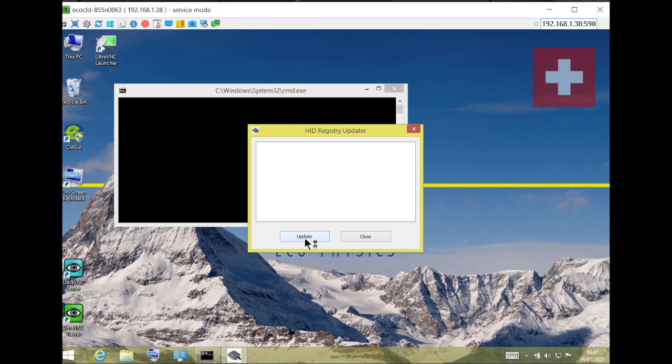The instrument switches to Windows mode and a registry update window comes up. Click update and close this window.